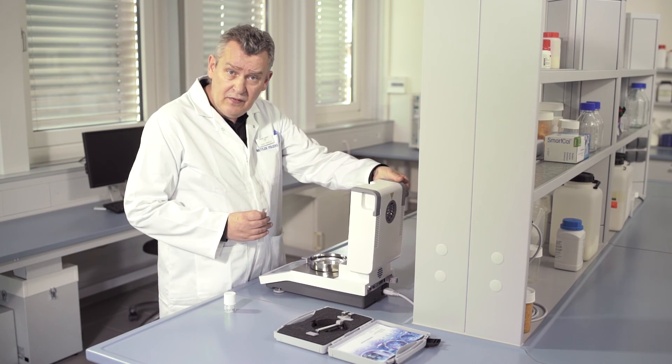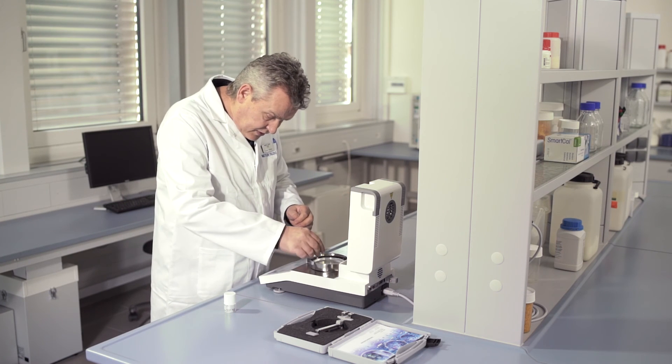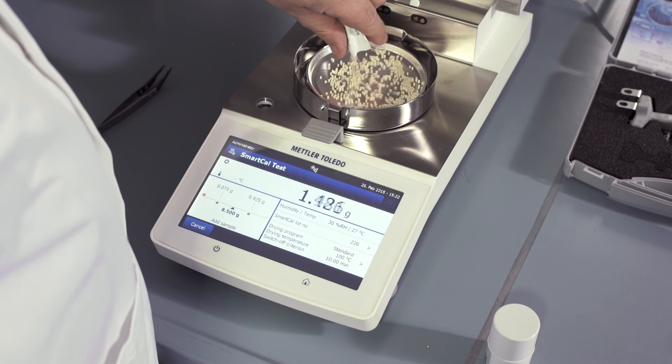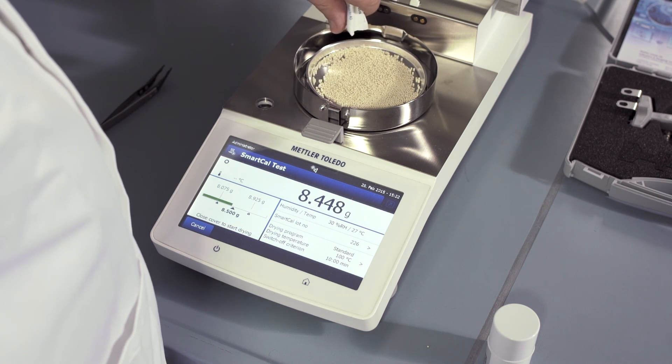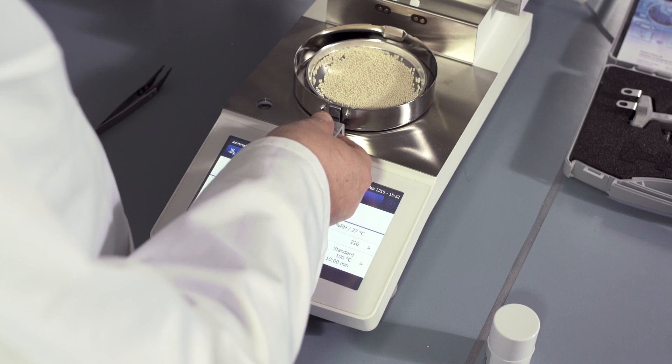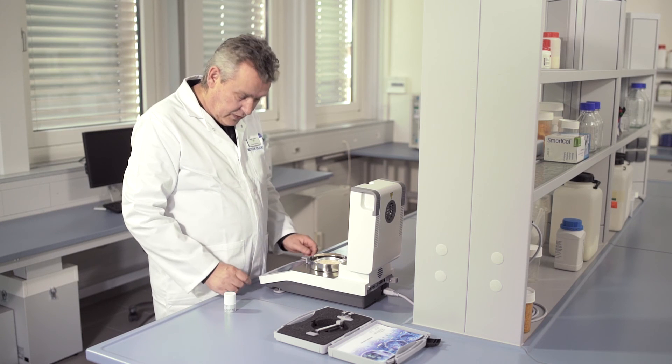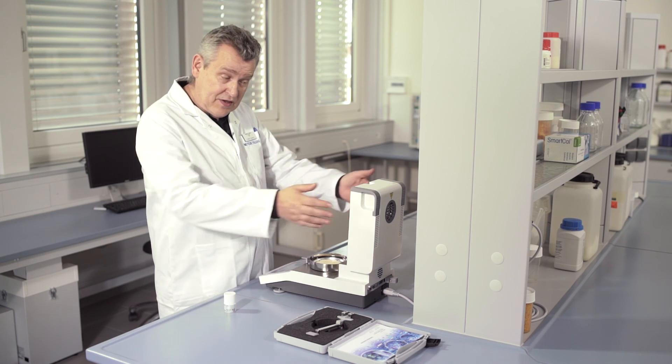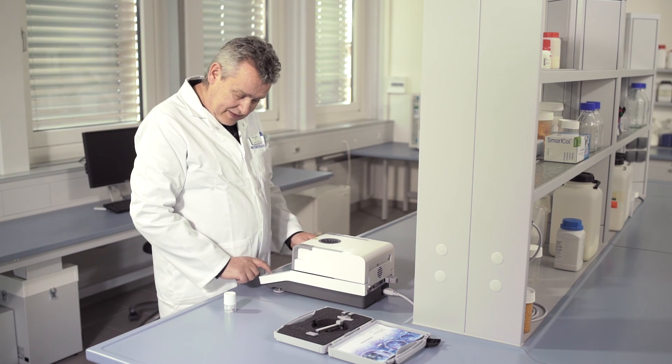Then open the lid and distribute the Smart Cal evenly over the entire sample pan, making sure that it's distributed evenly. Then simply close the lid and the Smart Cal test will automatically start.